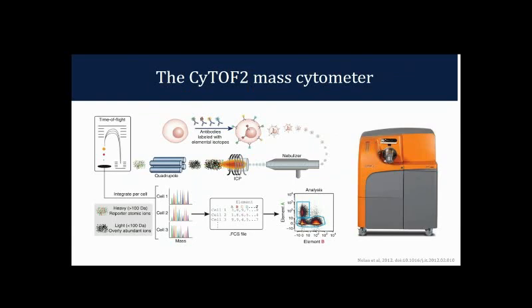So how does a CyTOF work? Well, we have a CyTOF here. This is what's sitting upstairs in the Biomedical Research Center. Basically, I want to just give a brief overview of how samples are run through this. I'll talk about staining in the next slide. It's kind of tricky what point you talk about staining versus running these samples.